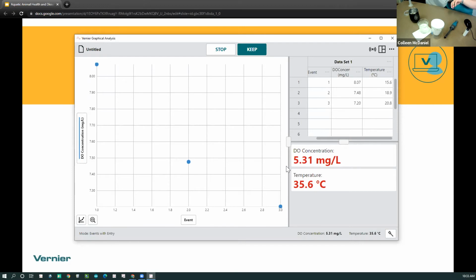All right, it's been a minute. Pour my sample in. And let's see what we've got now. So letting that reach equilibrium, where the temperature is having to go to a warmer state than what it was, or in this case, in a way a cooler state, because I had put it in my warm water sample to begin with. And so I'm letting it reach equilibrium.